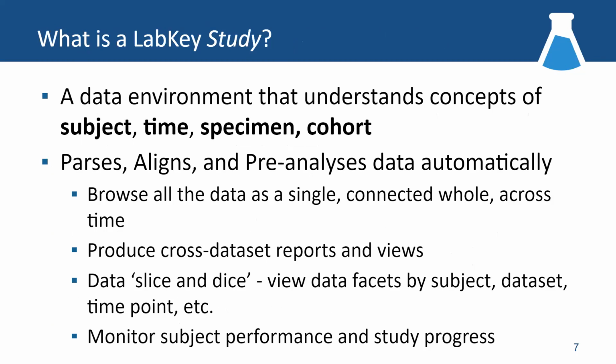There's a concept of a subject, and the subjects of your research can be pretty broad. LabKey's not just for animal models like primates or humans. We've had people put trees inside the study module. We've also, obviously, had lots of people use it for animal models, and for organisms, but people have even placed molecules as the central subject of the study module. Think big when you're thinking about the study module. It can really handle a lot of cases.